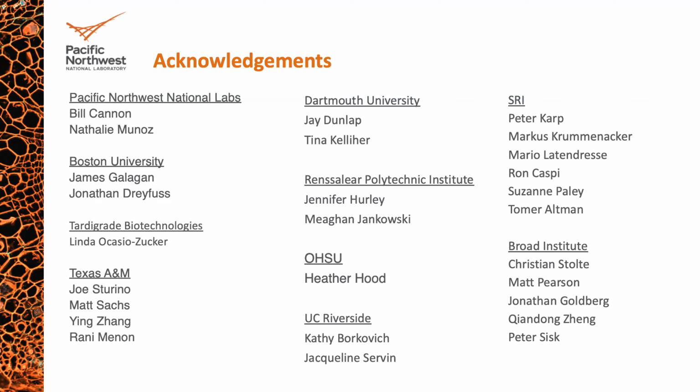We have a number of tools that can operate on a set of PGDBs. For example, you can issue searches across all the MAGs in a set to find what genes they contain, which organism has a given gene or a given pathway or a given metabolite. And you can create cellular overview diagrams, metabolic network diagrams for each MAG, each organism in the community. You can then overlay metatranscriptomics data onto that family of metabolic network diagrams to look at the activation levels of pathways across all the organisms in the community.